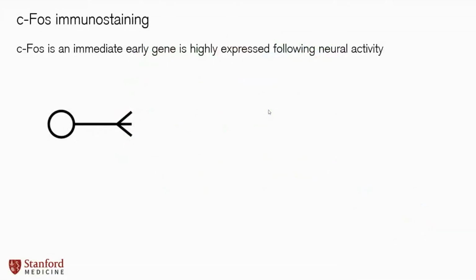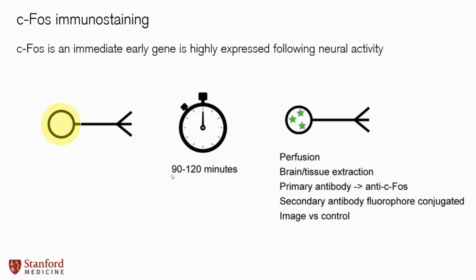I'm going to spend very little time on this because I don't love this technique. You can also do c-Fos in animal models, and you can't do that in humans because it requires you to kill the animal and pull the brain out. c-Fos is an immediate early gene that is expressed. So when a neuron is active, it starts to express this gene over a period of 90 to 120 minutes. And then you can pull the brain out and just use antibodies to look for it. I'm sure many of you are familiar with it.